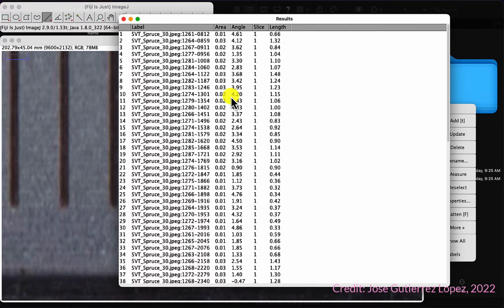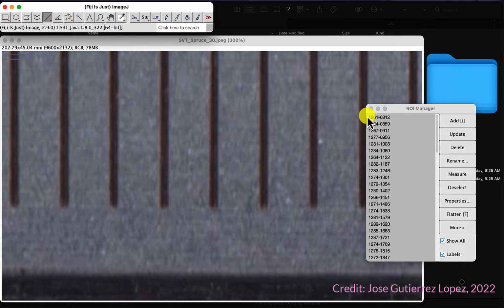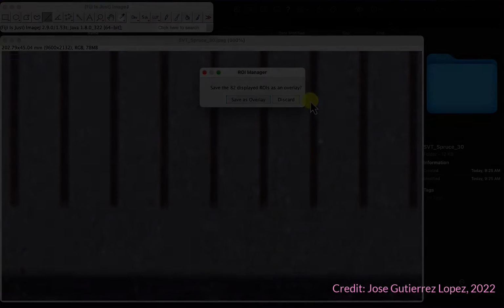Yeah, I'll need to think about that. But that's all we need to do. I'm not gonna save anything. I just wanted to show that.